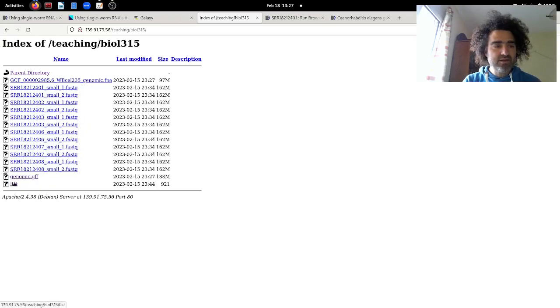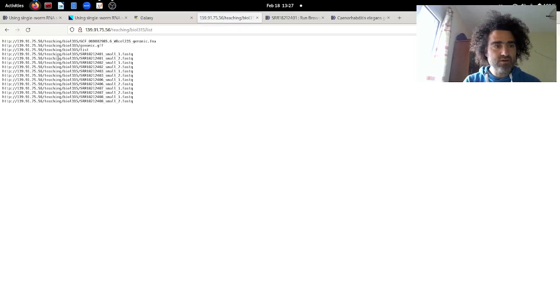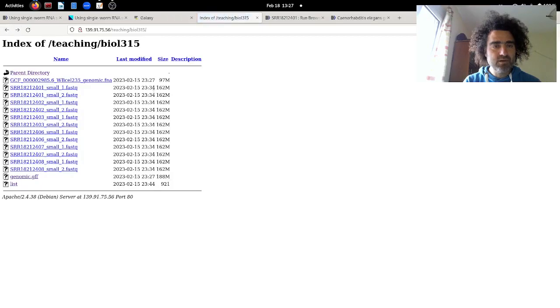This file here, the list, contains just the URL addresses of all the files here. If I just open it, it's just the URL addresses. I will need this later on when I will upload the data to Galaxy. Okay, so these are my data.